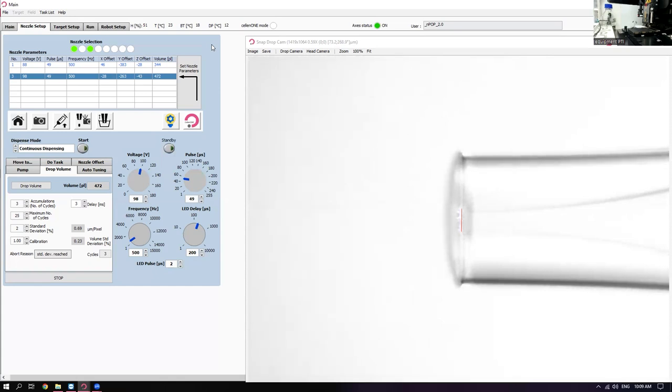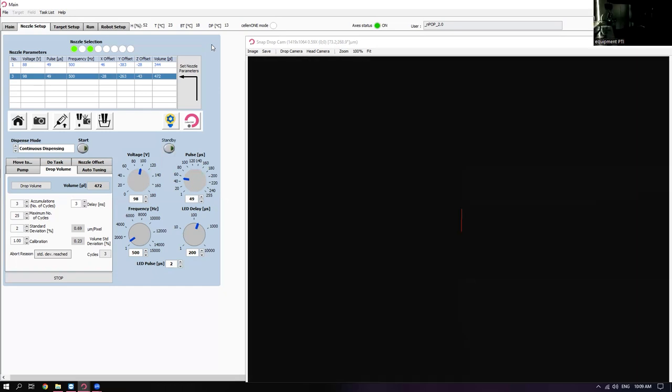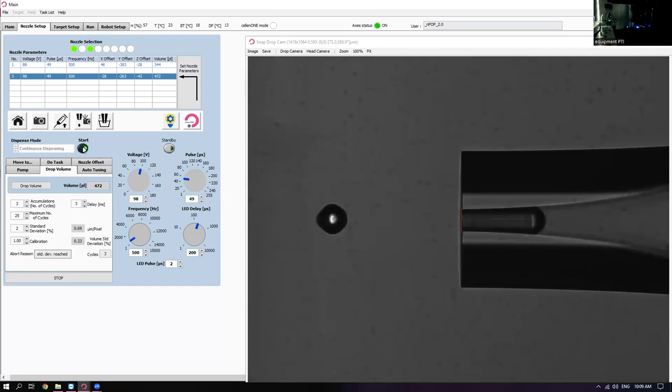So, all right, with that, let's dispense some DMSO. We can close the window now. See here. So we do have some interference from the light on the inside with our droplet imaging. So we're going to do some of this in the dark, and we can turn the light on as we go.